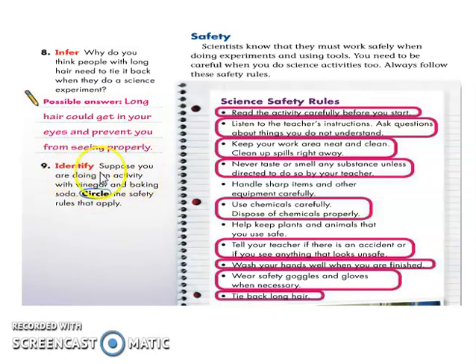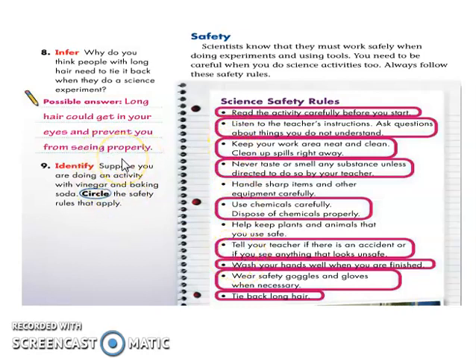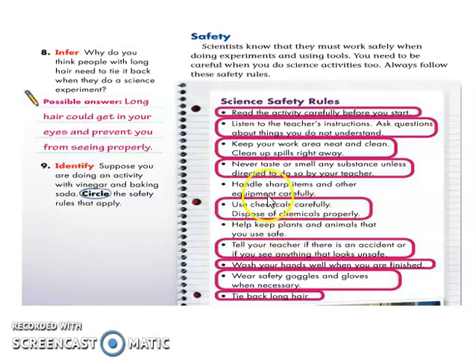Number nine — identify: suppose you are doing an activity with vinegar and baking soda. Circle the safety rules that might help you in the lab. There are nine safety rules listed. Not all apply to this experiment — for example, I didn't circle 'handle sharp items and other equipment' because we didn't use any sharp objects. I also didn't circle 'help keep plants and animals safe' because we didn't use plants or animals in that experiment.